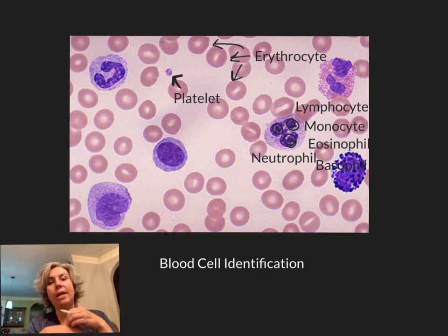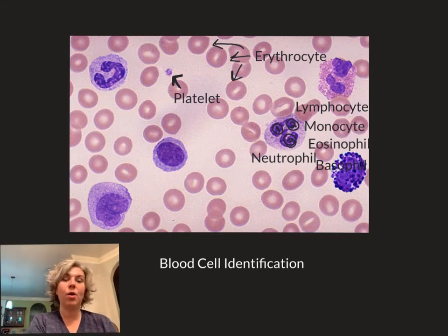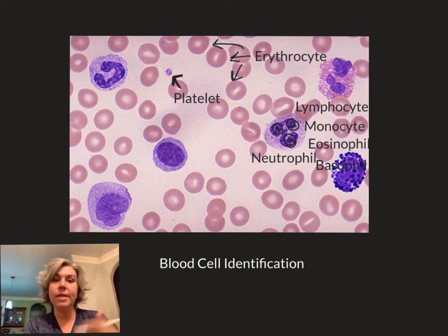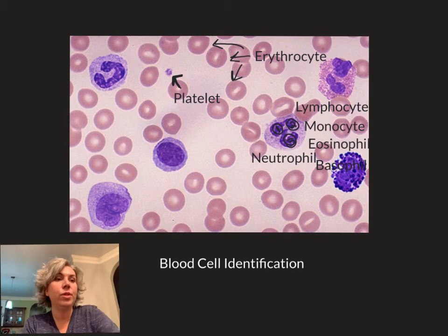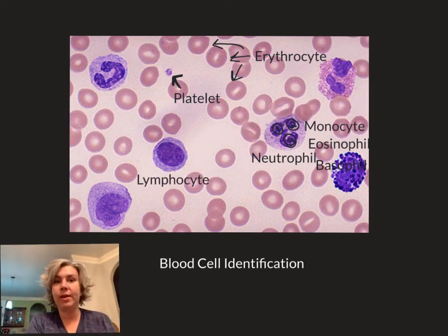So any area that's a localized spot of infection, you typically will see a large amount of neutrophils there. Now our next cell we're going to name are the lymphocytes. So never let neutrophil first. L is the lymphocytes. Lymphocytes have a nice round nucleus. So I'm going to drag this label right here under this guy right there.